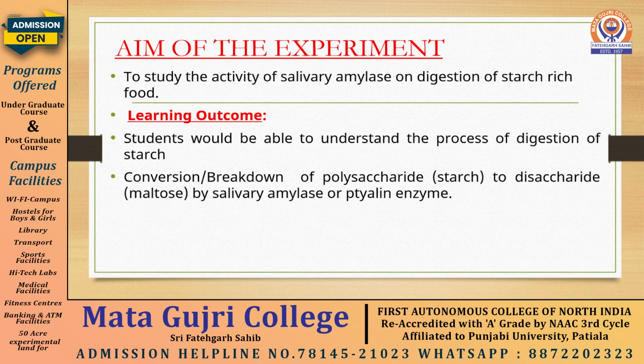The aim of this experiment would be to study the activity of salivary amylase on digestion of starch-rich foods, and the learning outcome would be that the students would be able to understand the process of digestion of starch. In short, how breakdown of polysaccharide, say starch, to a disaccharide maltose through salivary amylase or ptyalin enzyme actually happens.